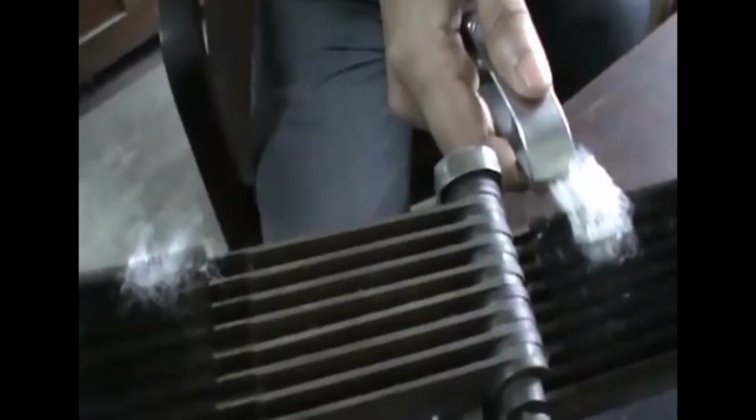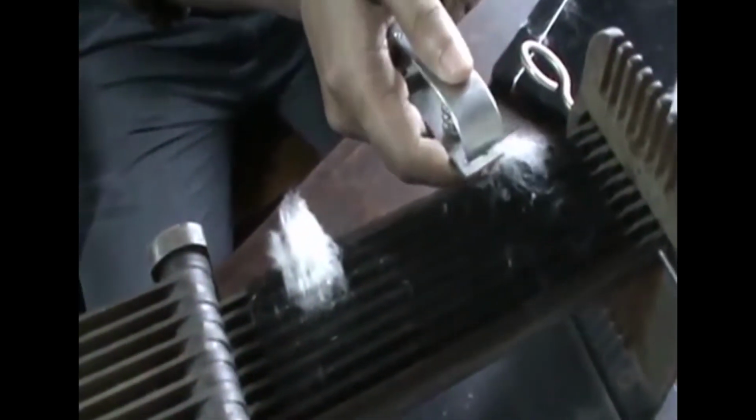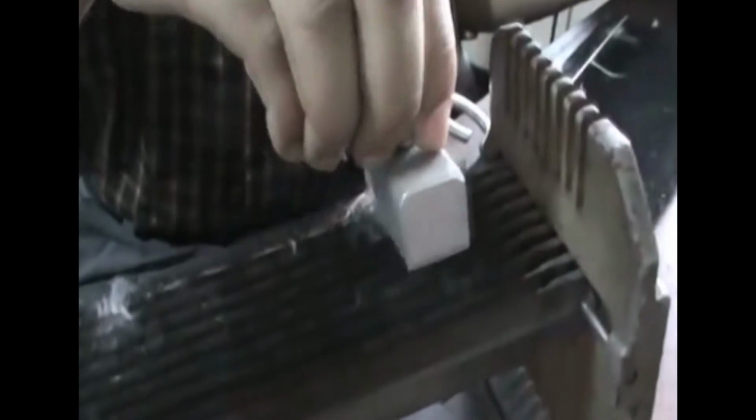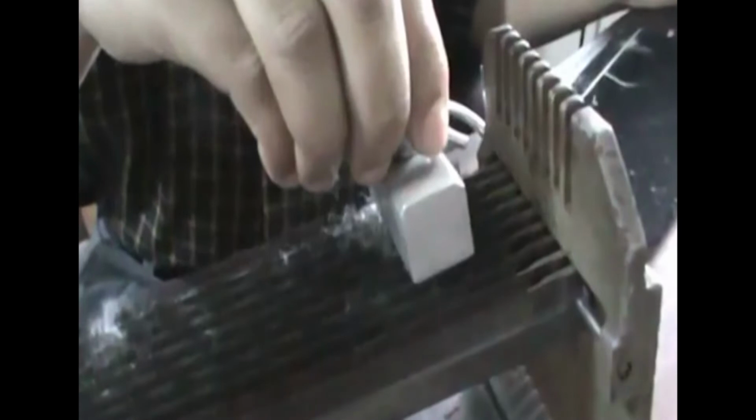Later, these are reincorporated in the original sample. A tuft is now pulled from the sample, care being taken to grip the hair as near the ends as possible. This tuft is combed several times and transferred to the left hand side of the sorter so that the coterminous ends of the hair are almost flush with the nearest comb and the tuft is straight and at right angles to the comb. The tuft is now pressed into the combs by means of the depressor.